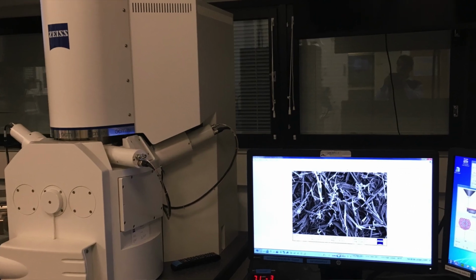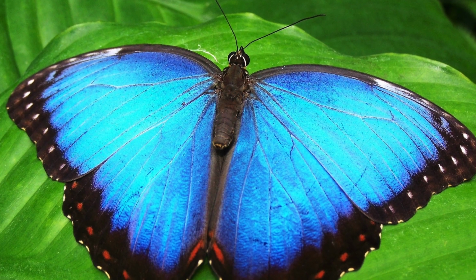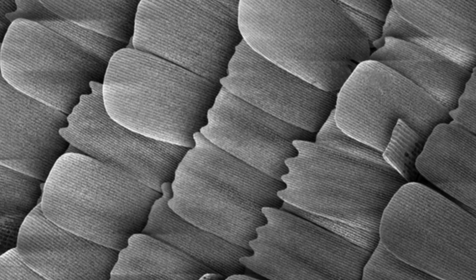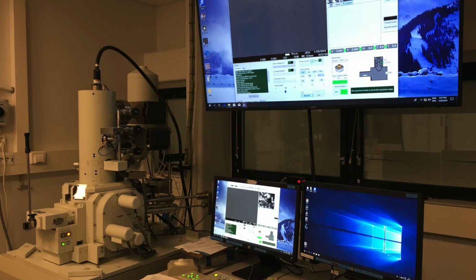Electron microscopy has revolutionized numerous areas of science. It has provided scientists with intricate details at the nanoscale of various objects. Like any other electron microscope, the scanning electron microscope also comes with certain limitations. It's expensive, it requires skilled operators and laboratory conditions. This also makes the instrument inaccessible to many students, teachers, and researchers.